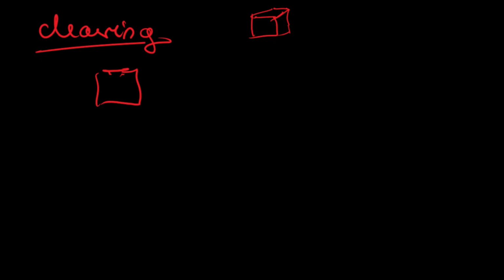Okay, it helps to make the cutting of the tissue easier. Now, in clearing, we now have our tissue block full of alcohol. What happens in clearing now is that this alcohol is replaced by xylene. So clearing replaces all of the alcohol in this tissue block with xylene.